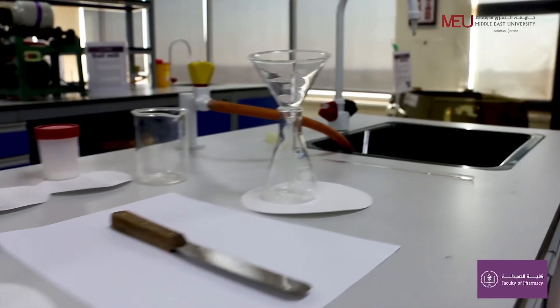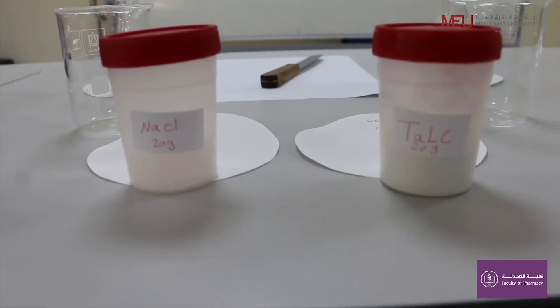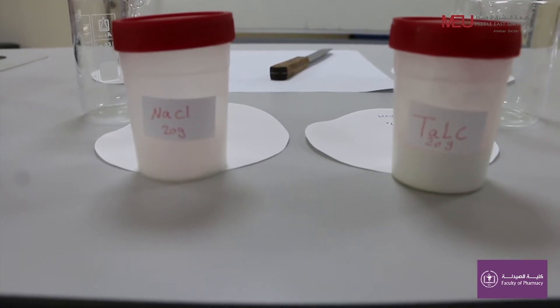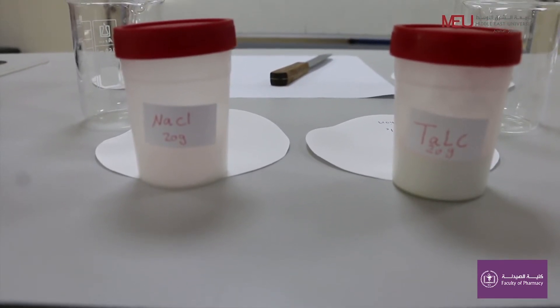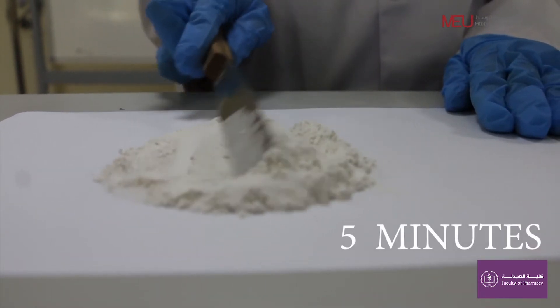We will start with spatulation. Weigh 20 grams of insoluble powder talc and 20 grams of soluble powder sodium chloride. Mix first for five minutes.